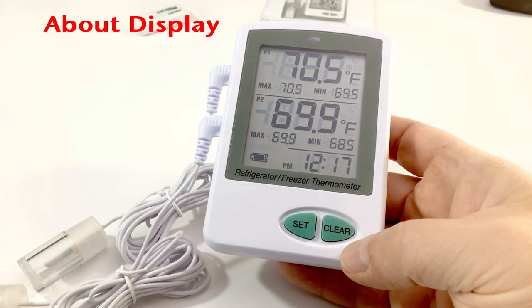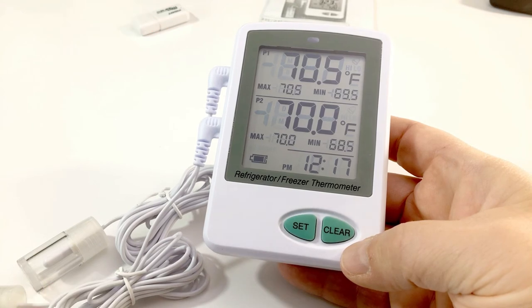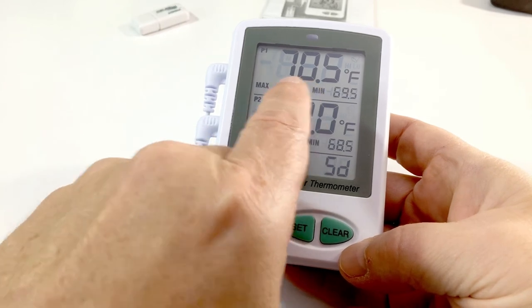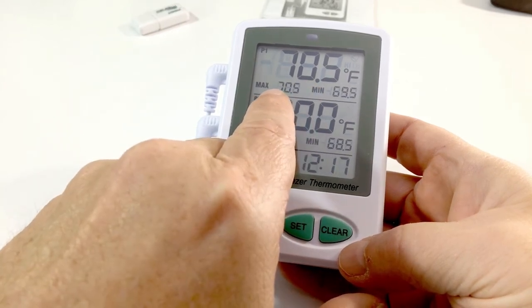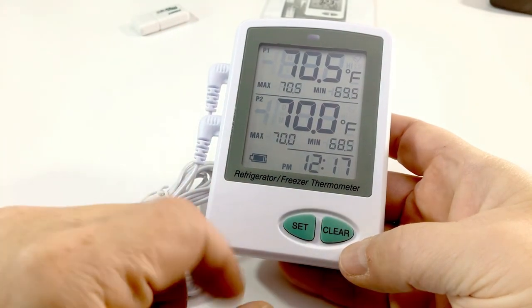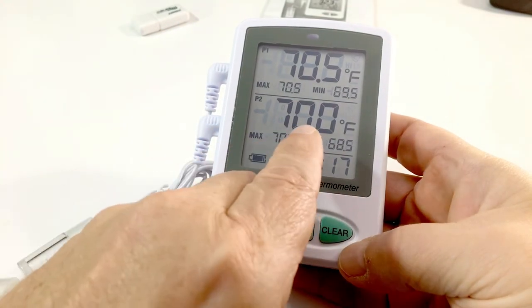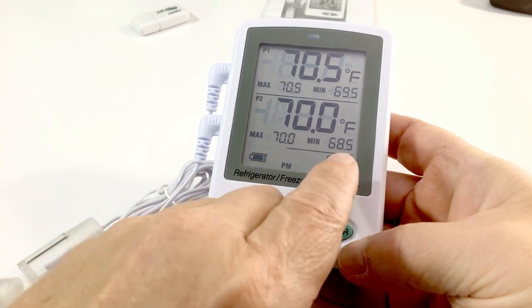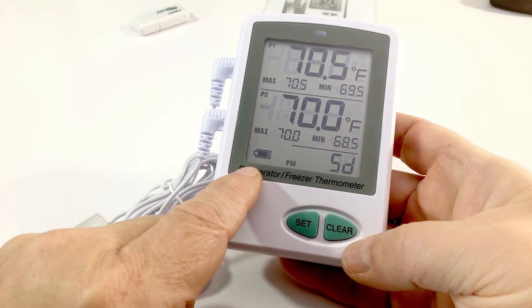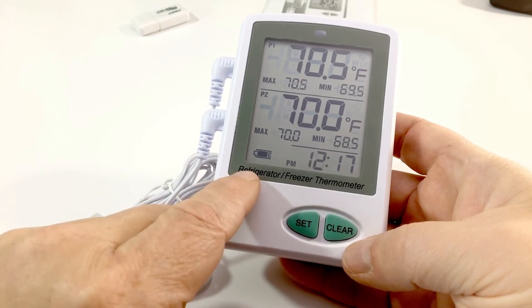Now that the unit is powered on, we can see the display is broken into three sections. The top two sections are for the probes. The large digits show your current temperature. To the left is your max and to the right is your min temperature for P1. The P2 probe section shows the same: current, max, and min. In the lower left-hand corner you have a battery symbol — if it is flashing, you need to replace the batteries.